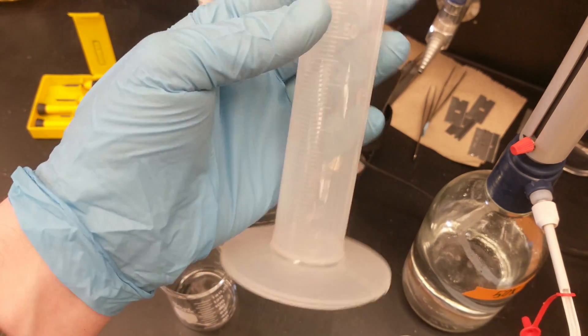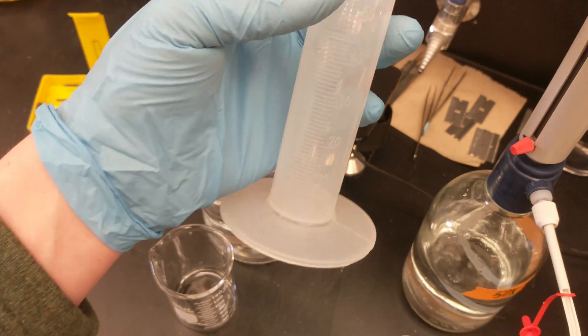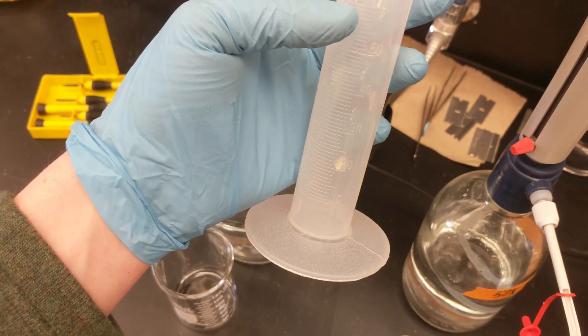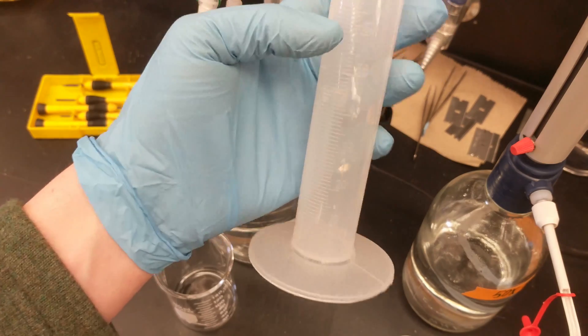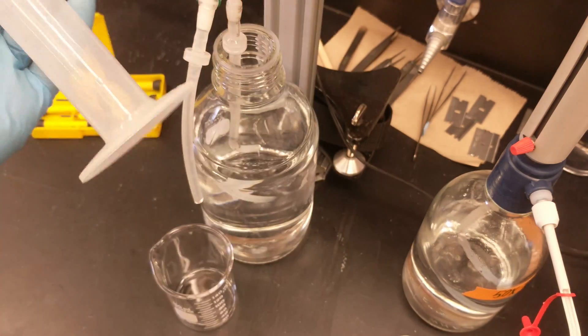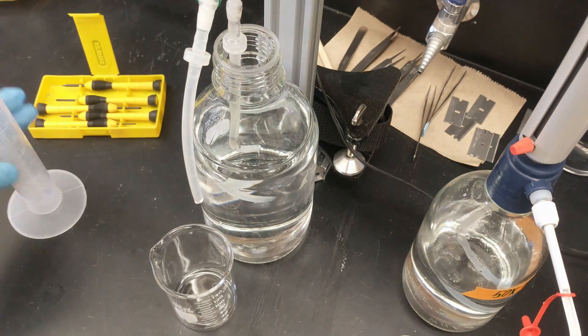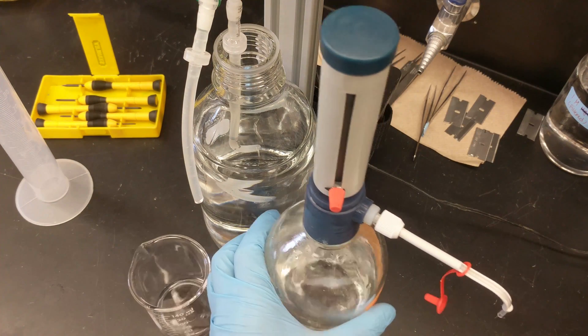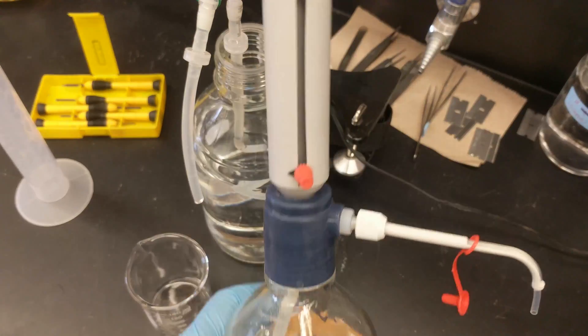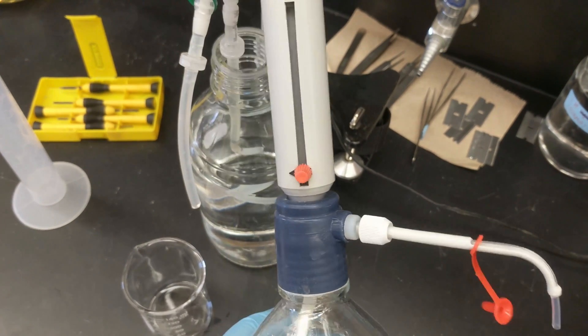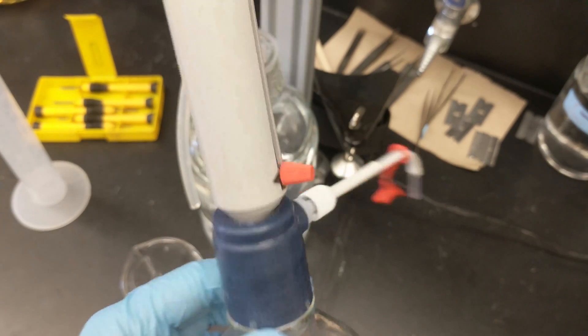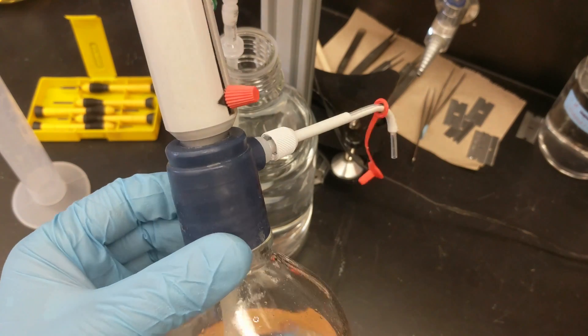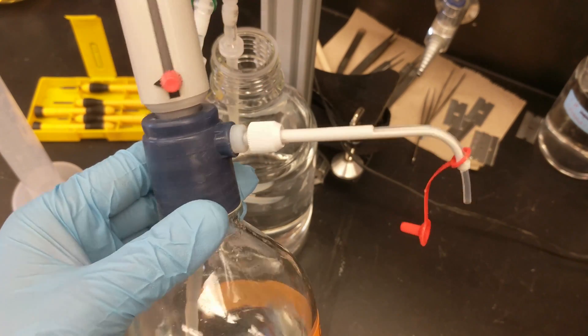So one way that you can solve this, for example if you need to dispense say 20 ml of buffer to make a liter of working solution, is something like this guy right here. I'm not sure what the brand name of this specific one is, I think it's called like a dispense set or something like that.